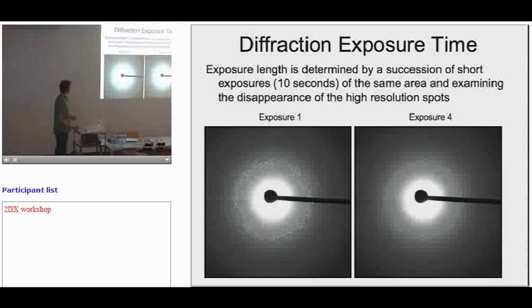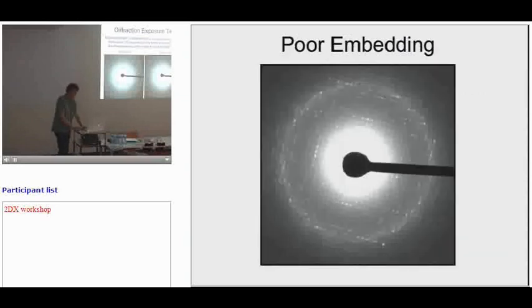That's how we calibrate the amount of time we take, because the beam is so weak. If you just try to measure the beam by the screen, it's 0 or 99.9, whatever your microscope will tell you. It's so low that it can't detect it.